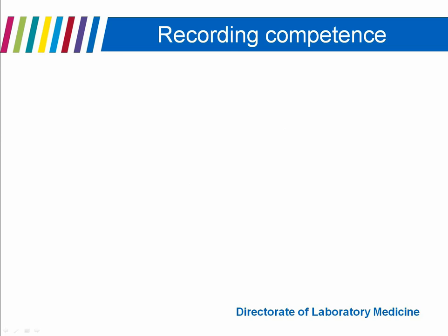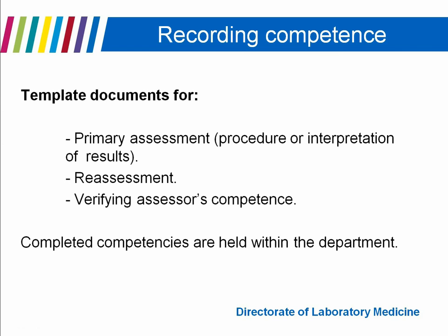Because we're an immunology department and we carry out a wide range of other tests, not just flow analysis, we have template documents, and we have 3 main documents that we use upon which to guide and record our competence assessments. We have a primary assessment document that covers the procedure or the interpretation of results, then a document for reassessments, and we also have a document to verify an assessor's competence.